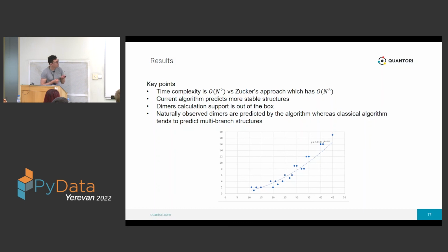And I would like to also mention that this algorithm is pretty much easily adjustable to finding out the dimers itself as well, right? We just strip that constraint of the yellow secondary diagonal, right, which we have seen before. And that's solving our problem out of the box.